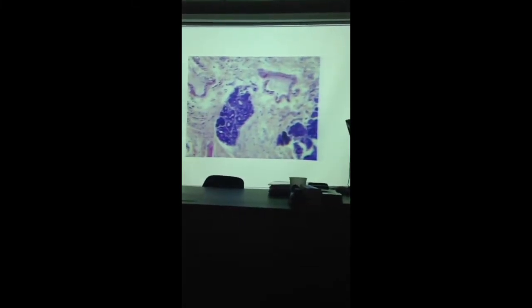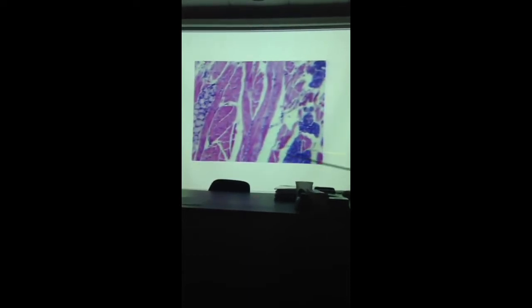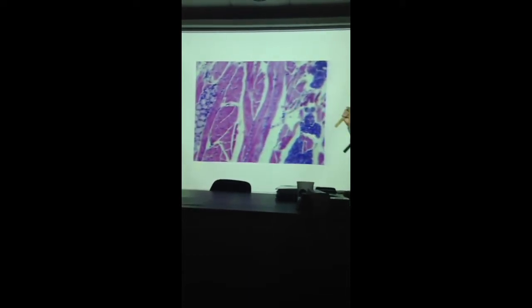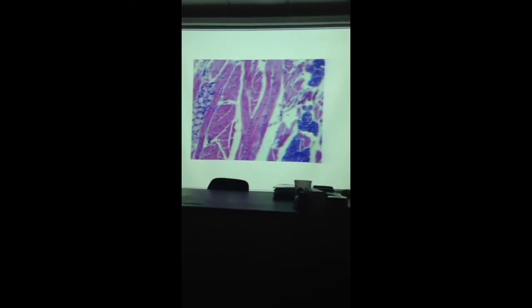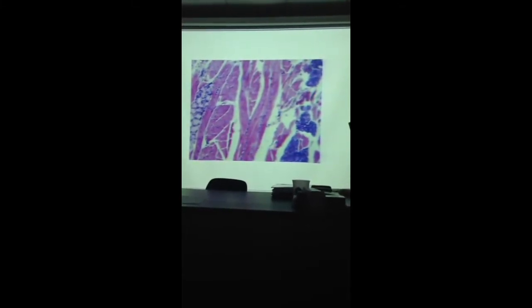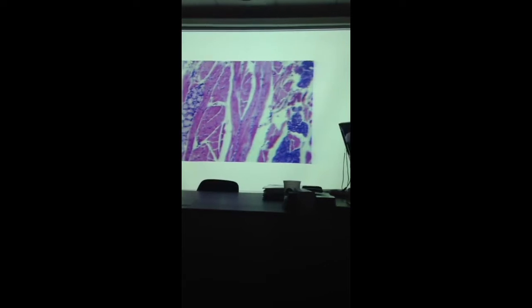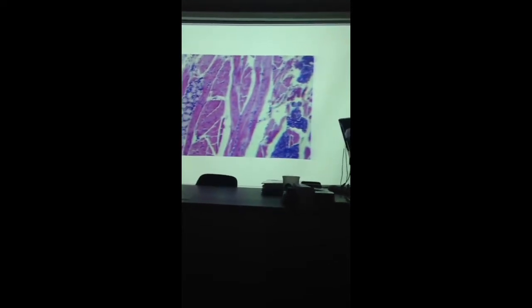You're also, of course, in the tongue. See this? What is this stuff? That is skeletal muscle. That's why we're able to accomplish so many movements with the tongue. Of course, skeletal muscle is the only one that's under conscious control. Smooth muscle and cardiac muscle are involuntary. They're not under conscious control. You can't decide when to contract and relax. Okay? So again, this slide is the monkey tongue, taste buds.